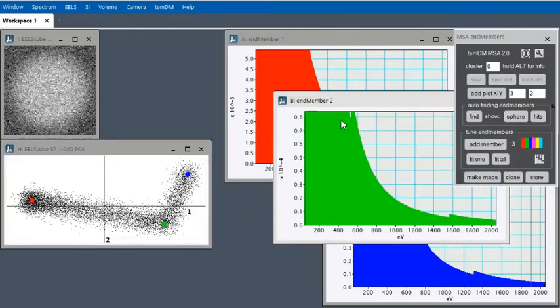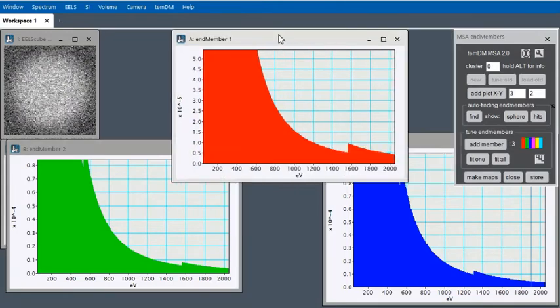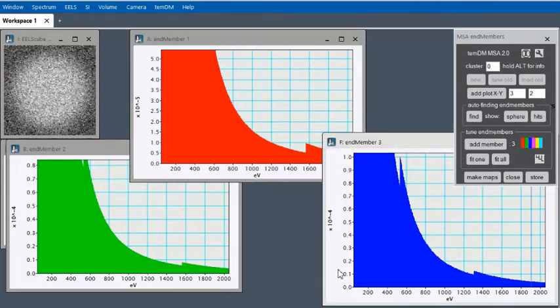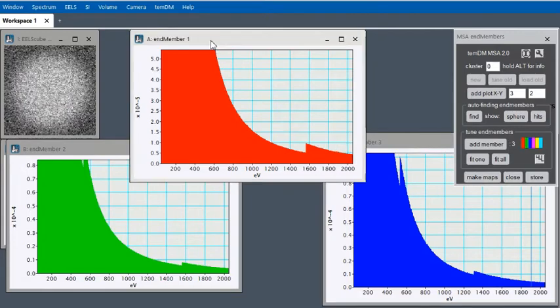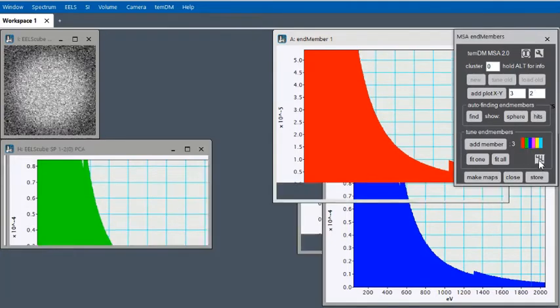You can move your spectra windows anywhere you want in the working space, but what is important is the location of the first spectrum and the last spectrum. You should place those manually, and all intermediate spectra, in this case one green spectrum, can be automatically placed in a cascade manner in between these two extreme sandwiching windows. Let's do that by clicking this icon.